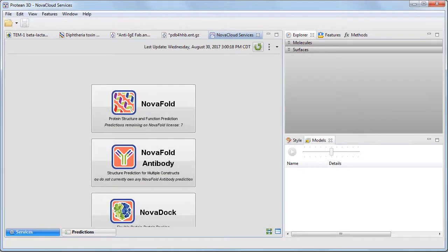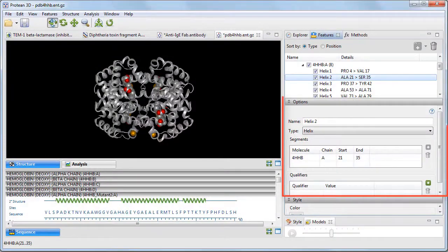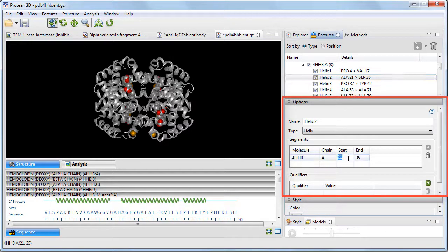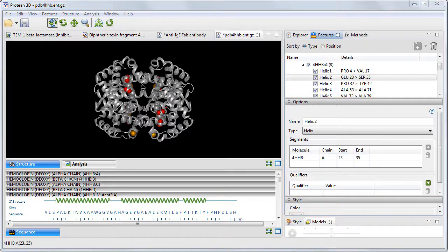If you're licensed to make cloud-based predictions with our NovaFold, NovaFold Antibody, or NovaDock applications, you can now initiate these predictions from within Protein3D, as well as using Protein3D to view the results. Also new to LaserGene 15 is the ability to edit features in Protein3D, and to export images to PDF format and editable images to PowerPoint format.